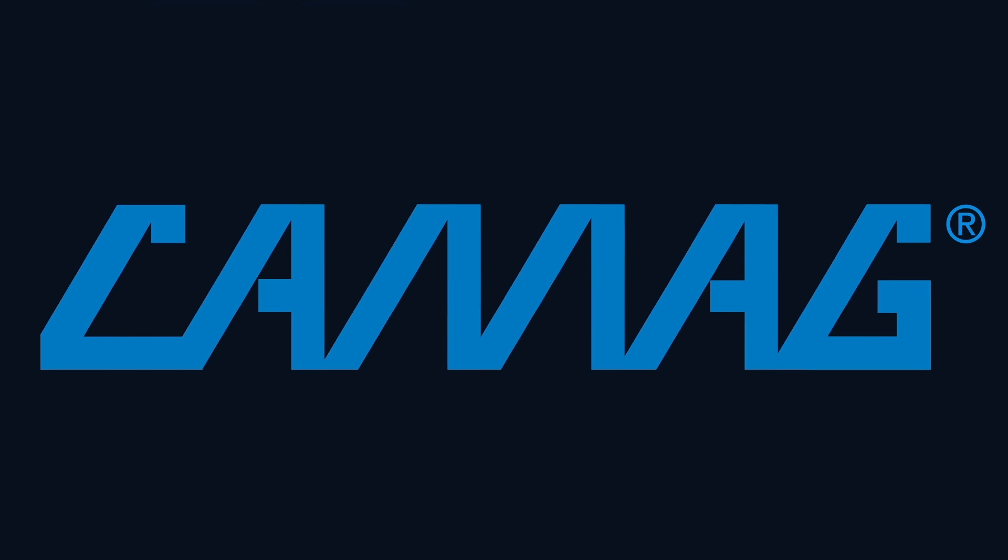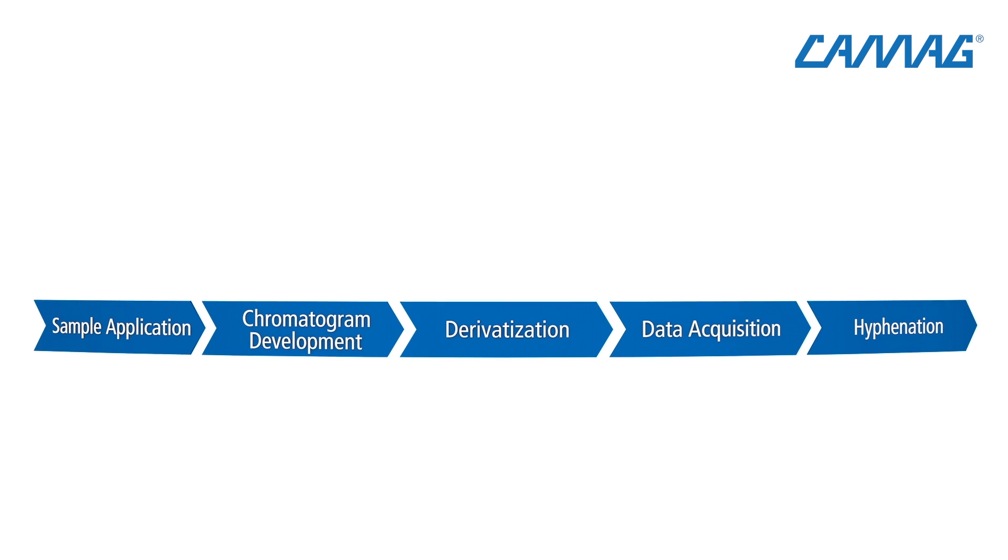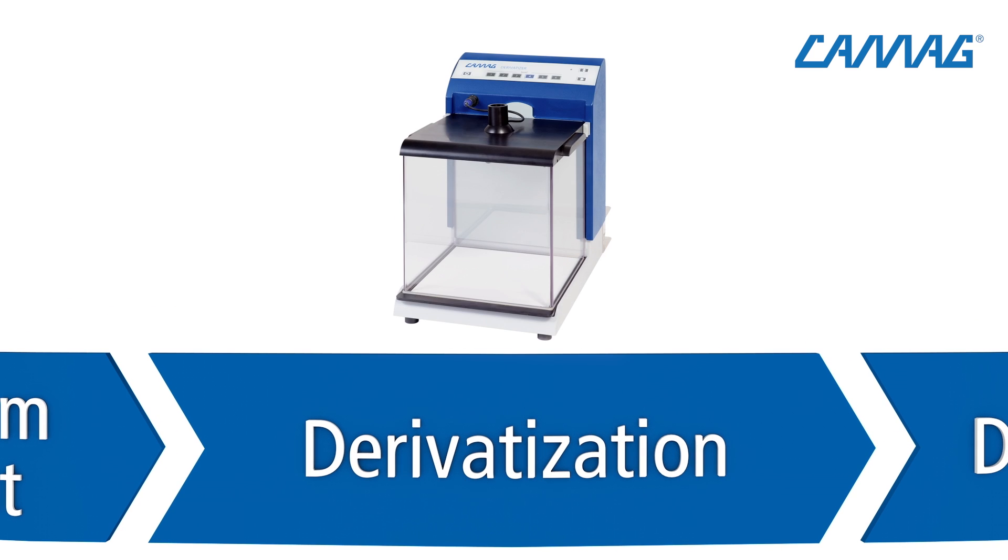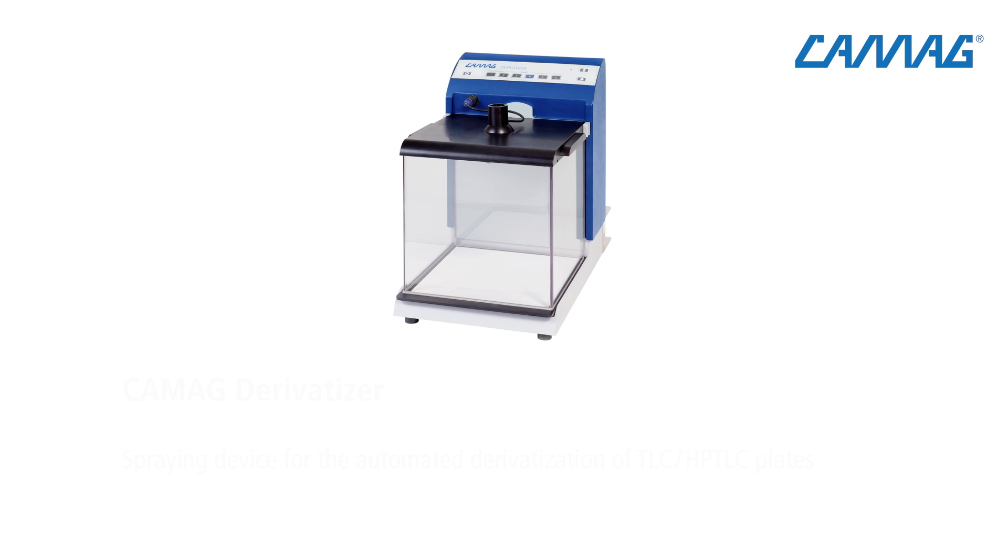CAMAG is the world leader in planar chromatography and provides instruments, software and consumables for all steps of the TLC HPTLC procedure. The CAMAG derivatizer is an automated spraying device which sets a new standard of reproducibility in the reagent transfer onto TLC plates by employing a unique micro-droplet spraying technology.